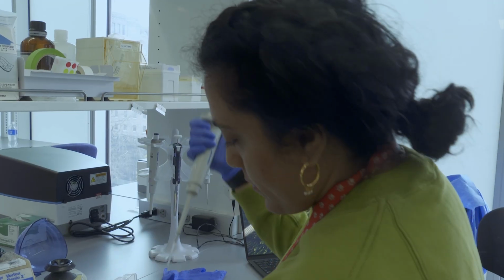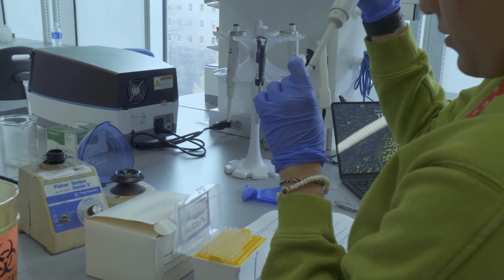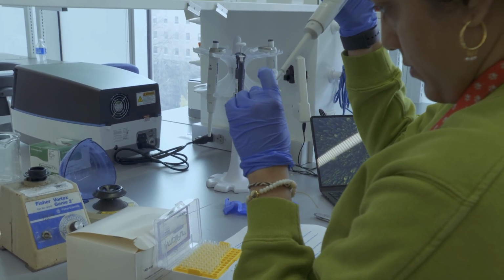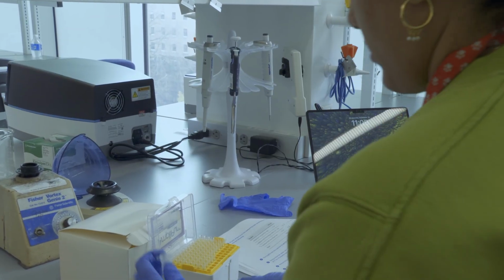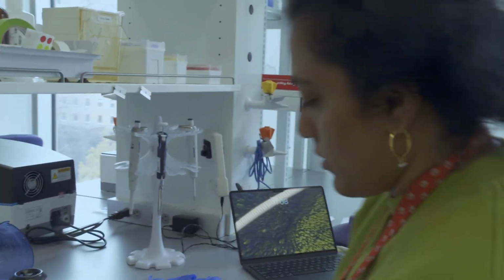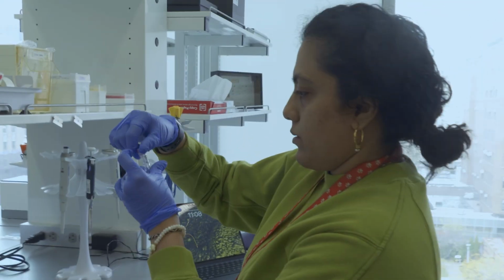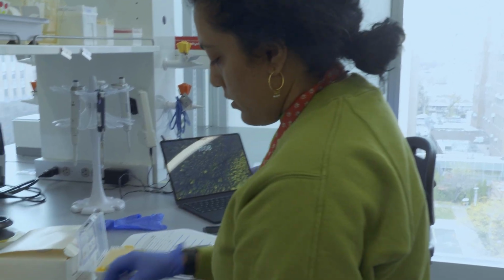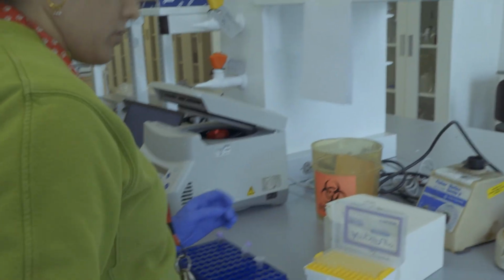I believe it's step 5: 37 for 15 minutes, and then hold at 4. Let's start it. Okay, I'll check this. You can go and start labeling all the PCR tubes.